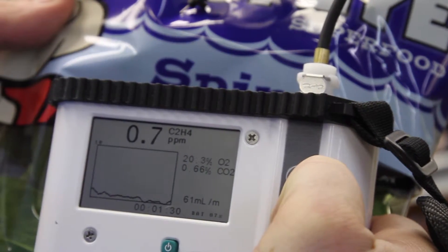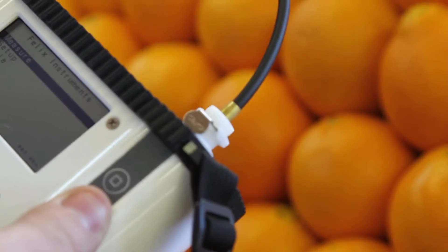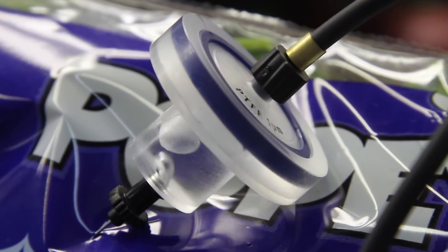The F950 Handheld Ethylene Analyzer delivers all three. And with the proprietary Polarsep water filter, you can be confident your measurements won't suffer inaccuracies from interfering gases and hydrocarbons.